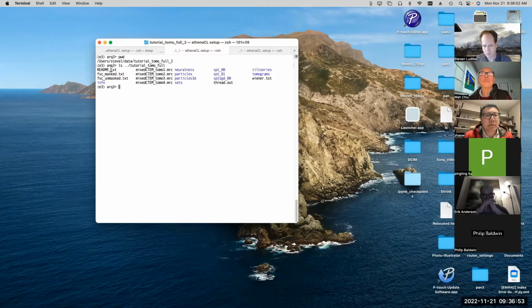so the completed folder looks like this. Right, so we've got a folder for tilt series, for tomograms. These are refinement runs. I ran 2 different refinement runs. This was for making an initial model. Then we've got the boxed out particles, both the 2D, which are the sub-tilt series, and the 3D, which are the reconstructed individual 3D particles.